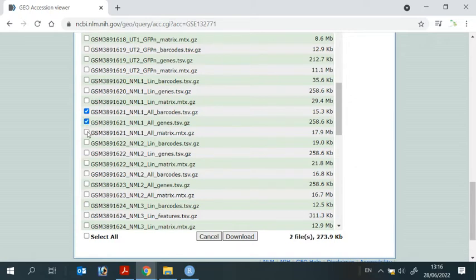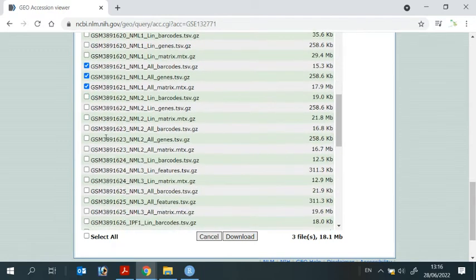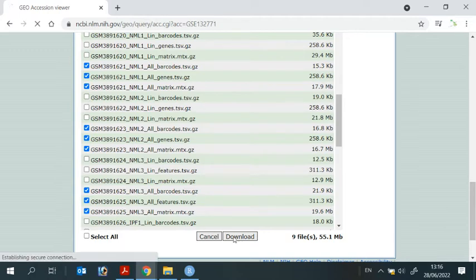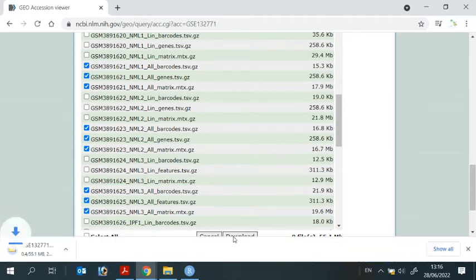NML1, all kinds of cells. NML2, all kinds of cells. And NML3 all. So we can go ahead and download it.